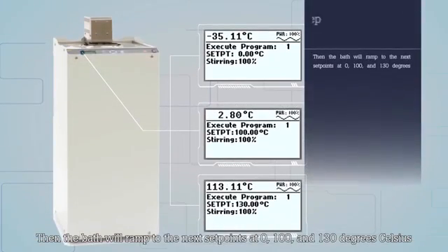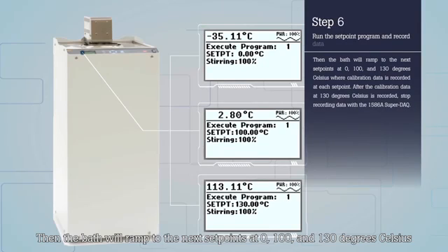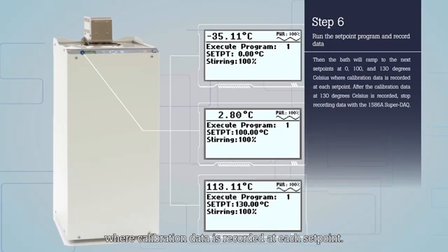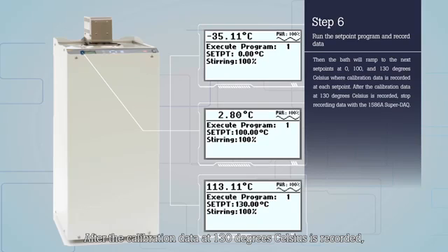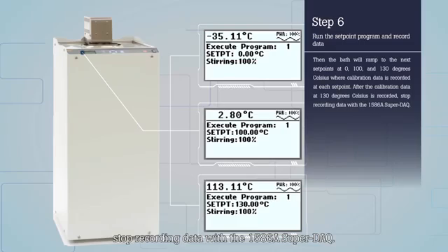Then, the bath will ramp to the next set points at 0, 100 and 130 degrees Celsius where calibration data is recorded at each set point. After the calibration data at 130 degrees Celsius is recorded, stop recording data with the 1586 Super DAC.